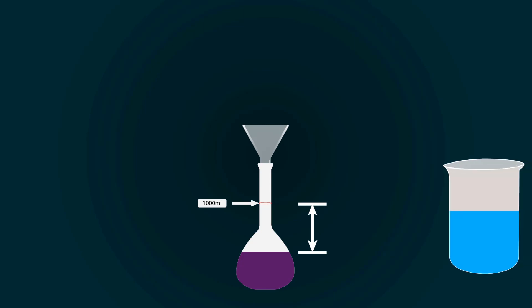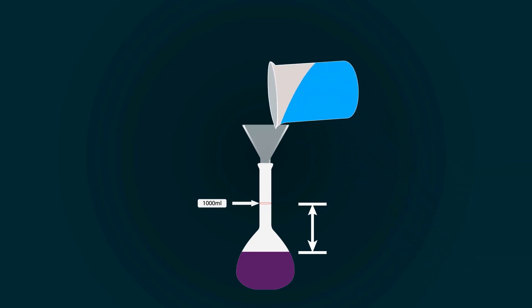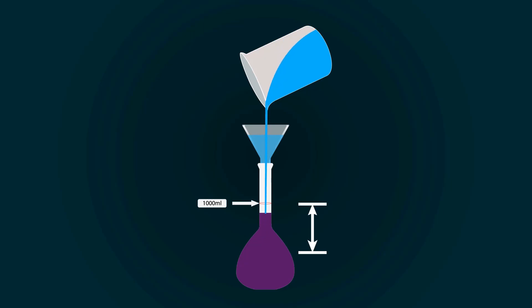Take more distilled water into an empty beaker and start pouring it into the volumetric flask.